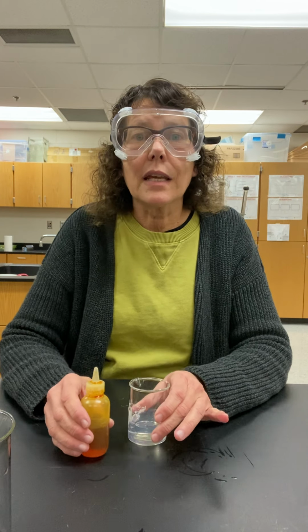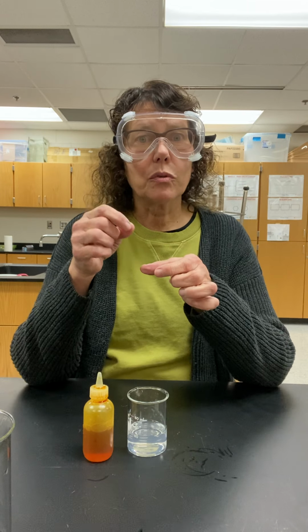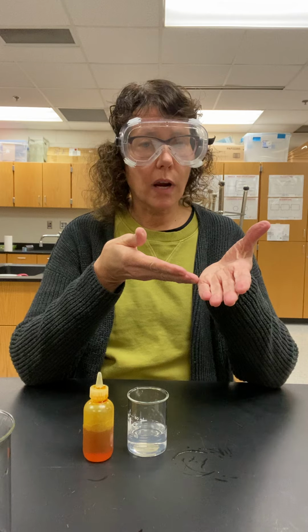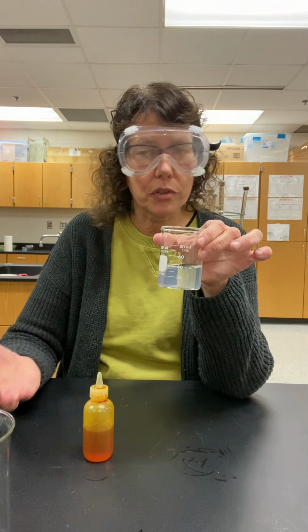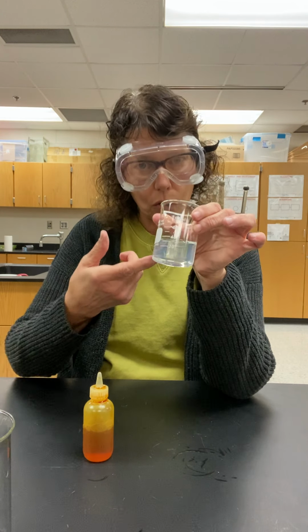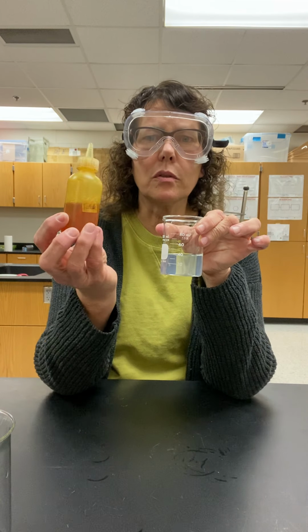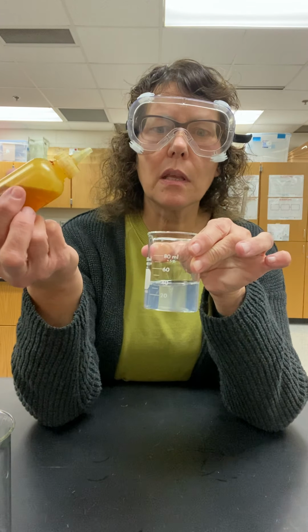If you've done any kind of chemistry, you might have used indicators to show you when something is present. A lot of times we'll do a trick where we break up crackers and we drop iodine on it because iodine and starch, which is what's in crackers, turns color. So what I have in this beaker is just plain old starch, like what you'd find in a cracker, but it's a solution, so we've got all the cracker crumbs out of it, and I've got this kind of old solution of iodine. It's going to take quite a bit of this just because it's old, but watch what happens to this.